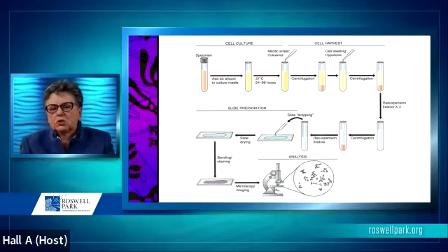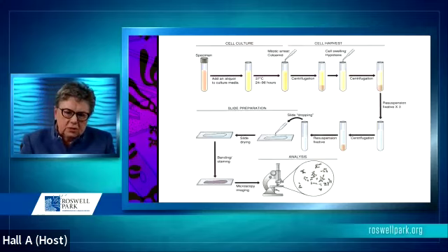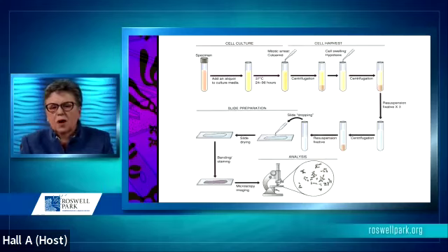This material is then physically dropped onto a glass slide. The slide is dried. The material is dipped in a trypsin solution to introduce the banding pattern, and then stained with Giemsa stain to introduce the G banding, and then analyzed by microscopy.